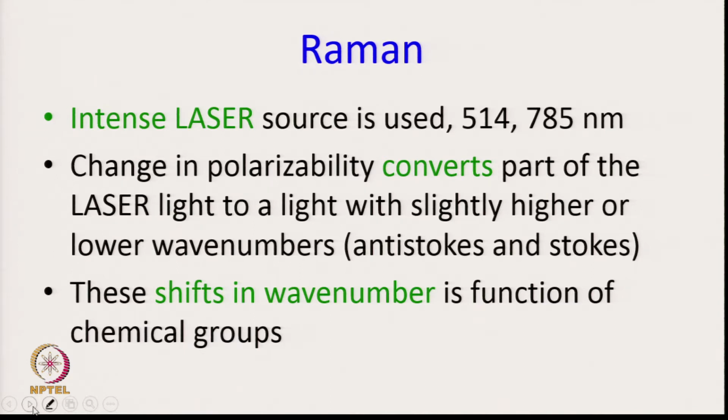As I will explain in the future slides also in a more diagrammatic manner, Raman signals are actually very weak. They get created in a very small manner.